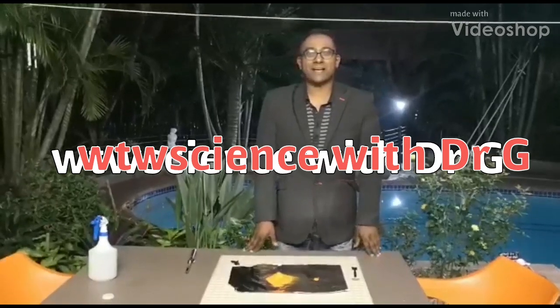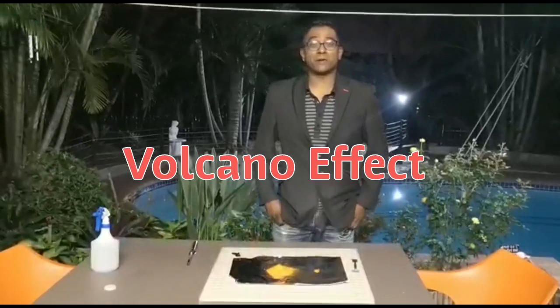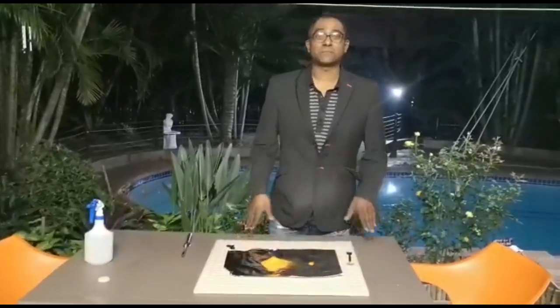Hi folks, welcome to WTW Science with Dr. G. It's been a long time and today we're going to be experimenting with chemicals, more specifically ammonium dichromate.